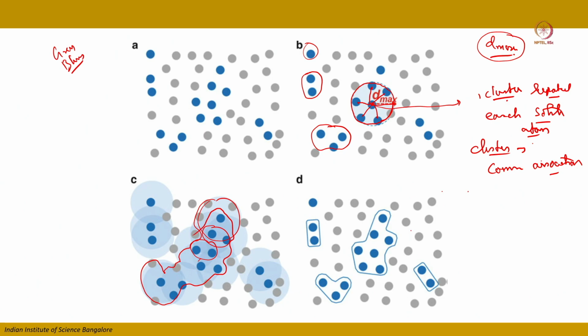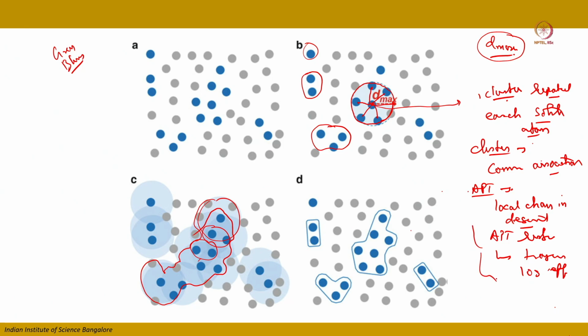But you know that in atom probe we have a local change in atomic density, and the APT resolution also depends upon the trajectory aberrations and local magnification effects that might directly introduce errors in the results or the identification of the clusters.